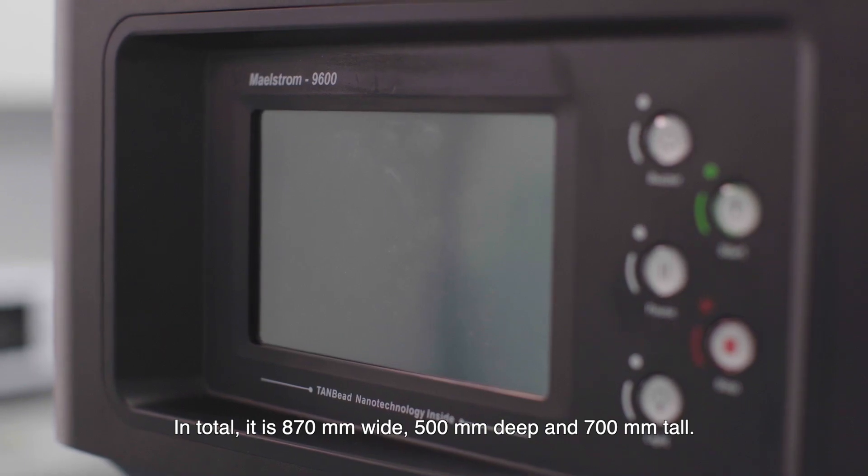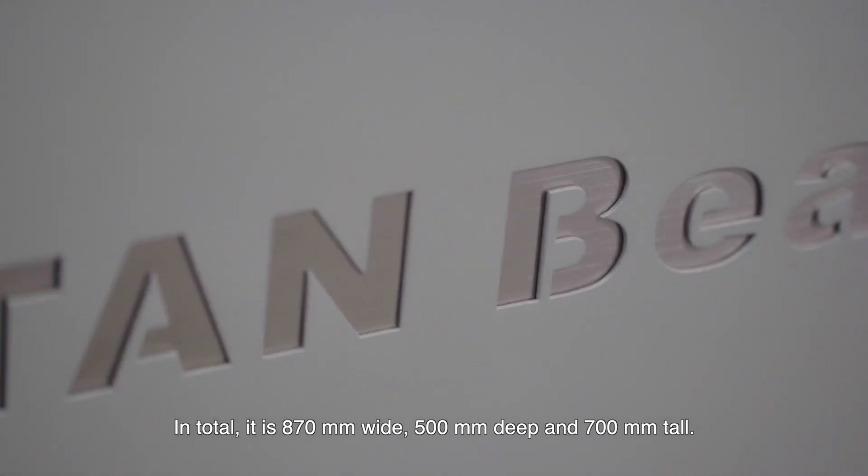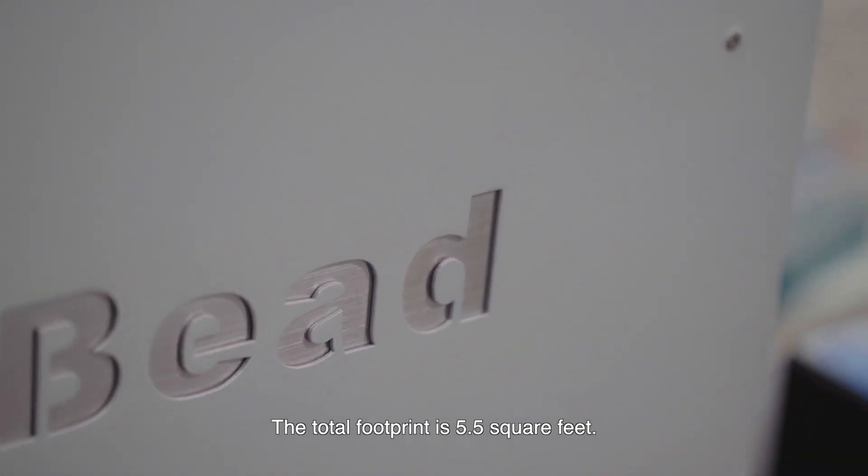In total it is 870 millimeters wide, 500 millimeters deep and 700 millimeters tall. The total footprint is five and a half square feet.